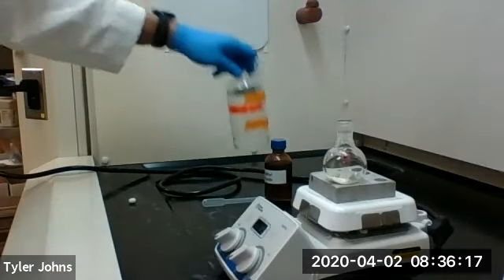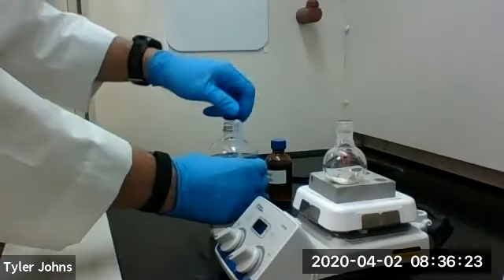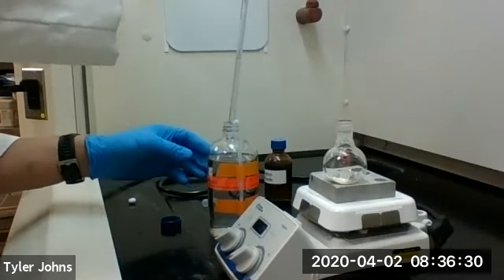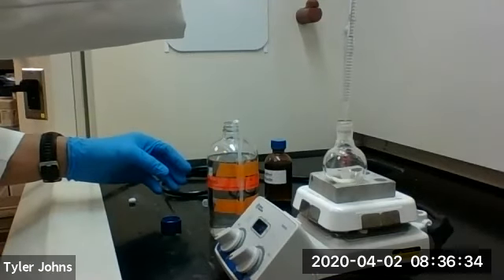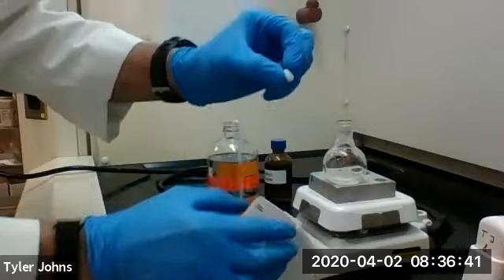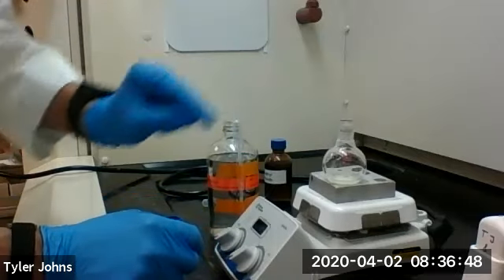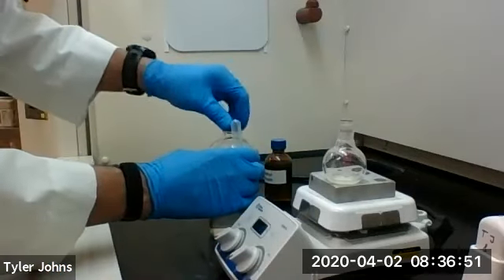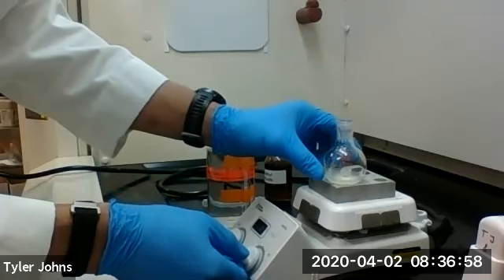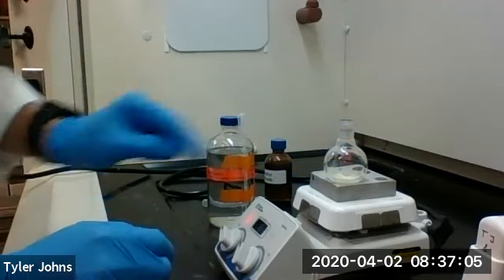We're next going to add three and a half milliliters of methanol to our 0.5 millimoles of chalcone and a stir bar. We're going to stir and heat to try and get our chalcone to dissolve in the methanol. We're going to let this dissolve for a few minutes.